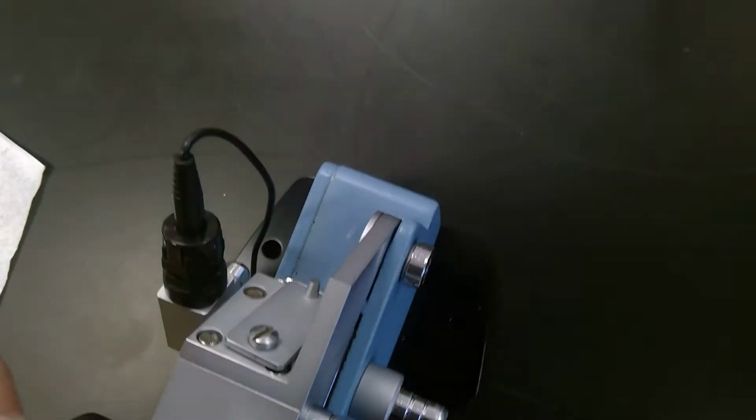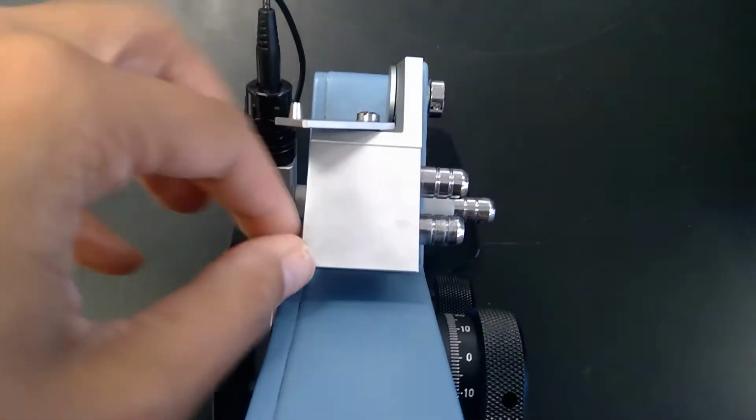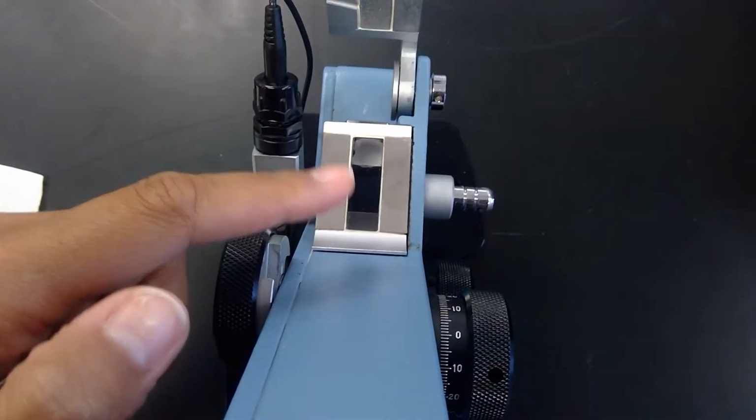And then we have this area that we can let our light in. And you notice once I open it up, it's no longer green, it's clear. And then we have the other area in which we would just turn the knob and open it, and this is where we would put our sample.